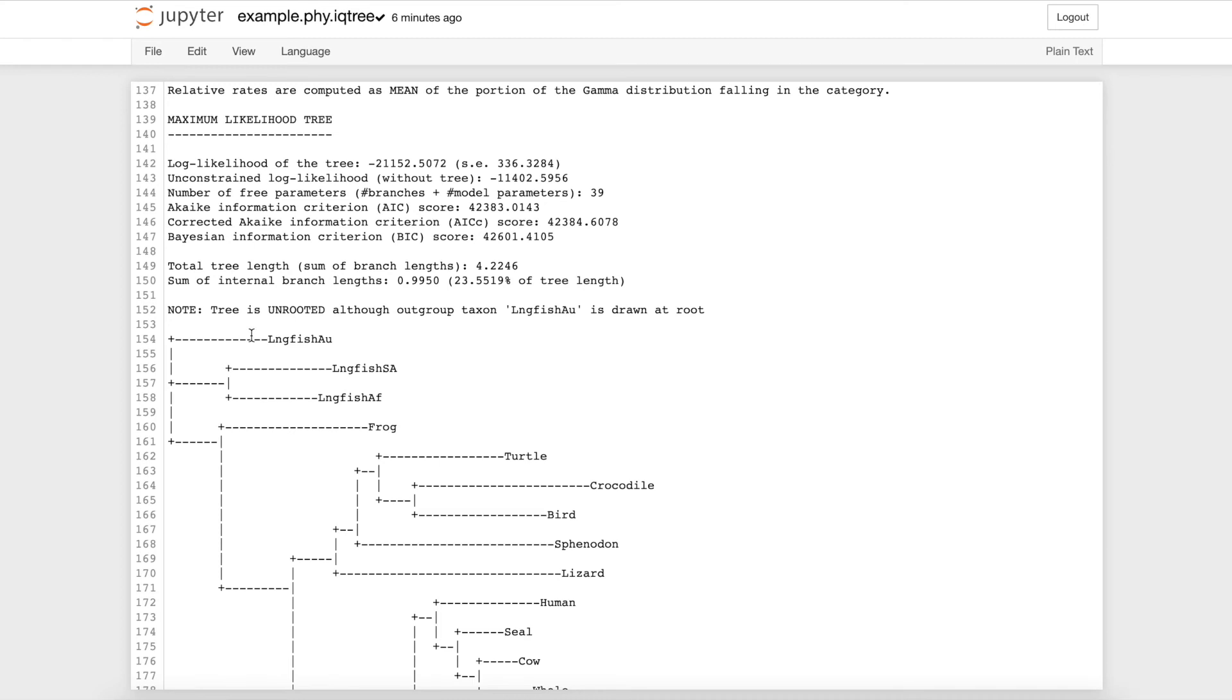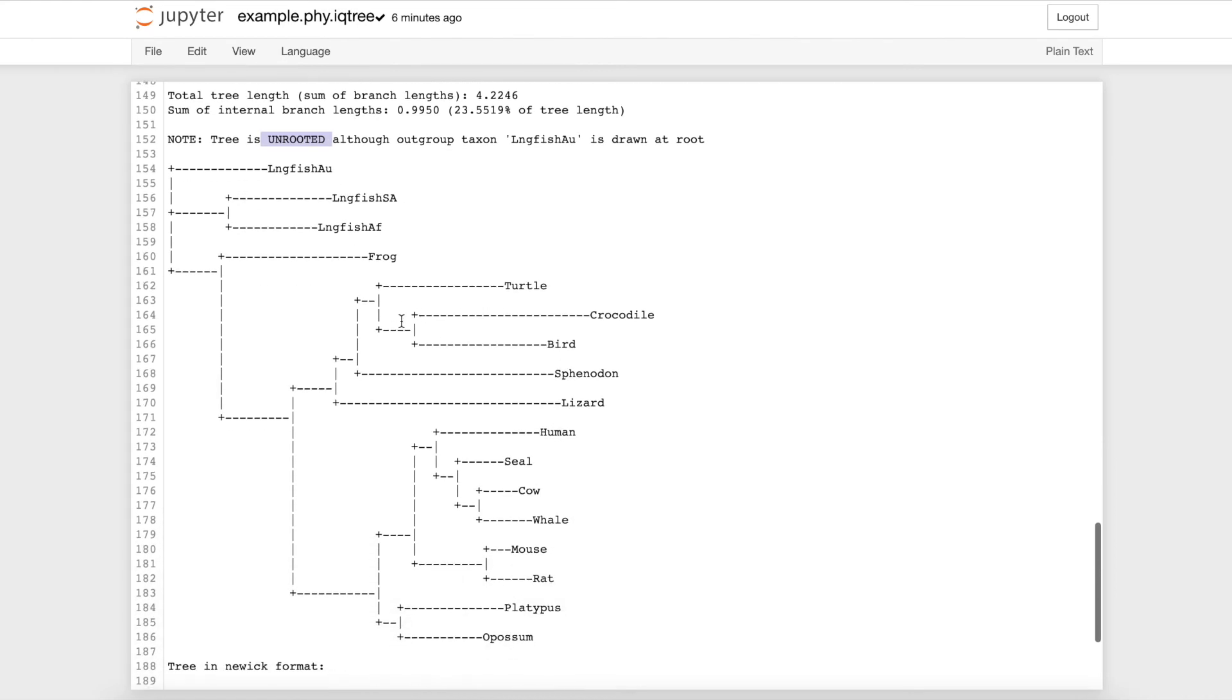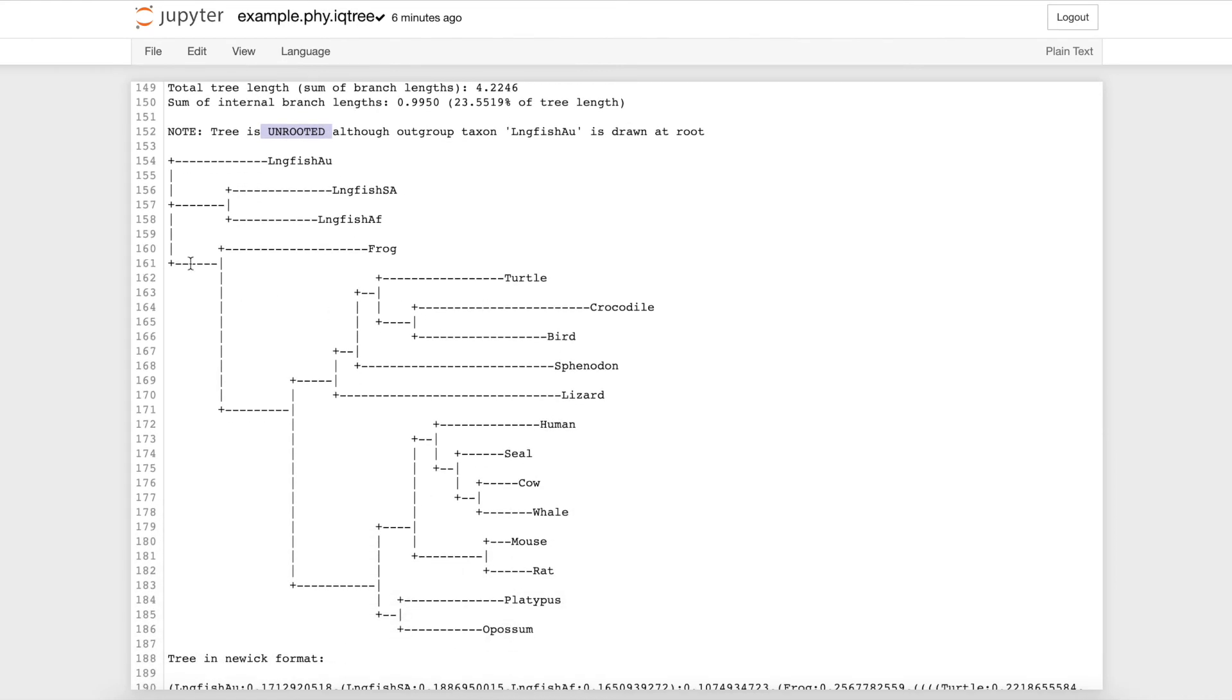Another thing to note is that the tree is unrooted, which is indicated here. This means the tree doesn't show a common ancestor for all the organisms from the file. The tree represents relations between the organisms, but doesn't indicate common ancestry.